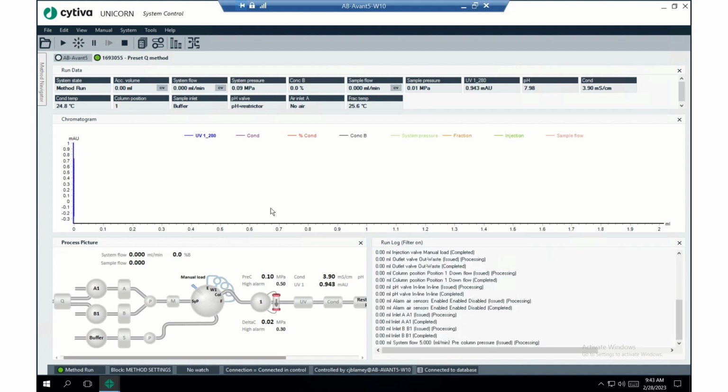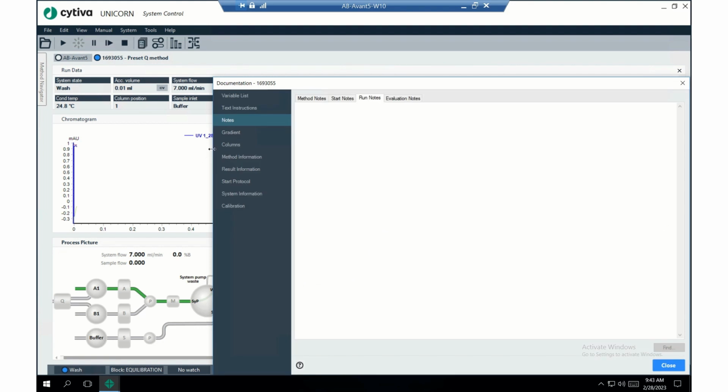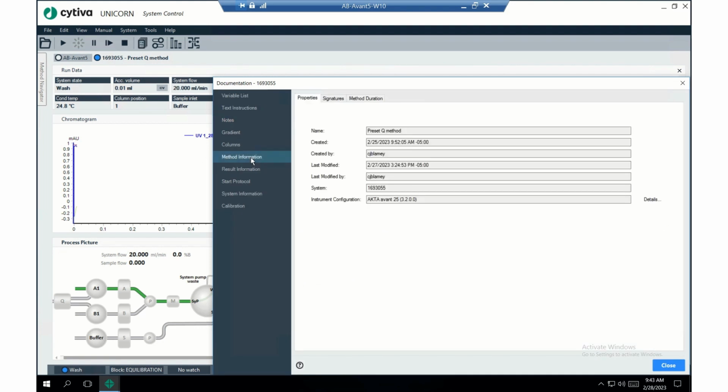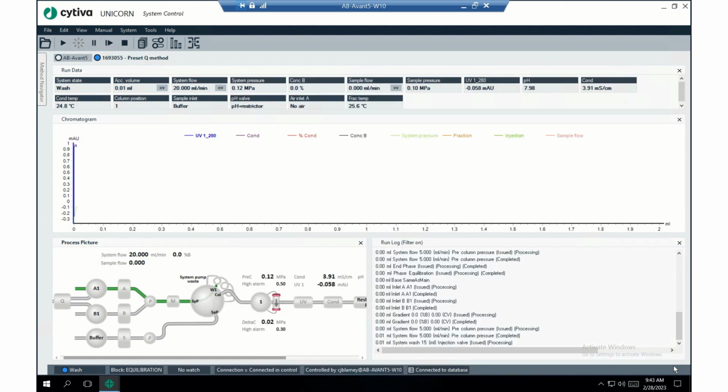Great. Let's check how long it will take to run the method. So we're going to go up here to documentation, and we'll select method information and method duration. Okay, it's going to take 24 minutes. So I'm going to turn it off now and come back in 24 minutes and we'll discuss the result.